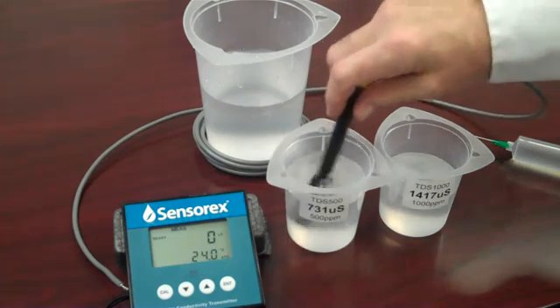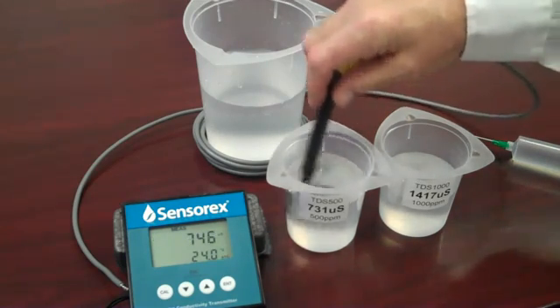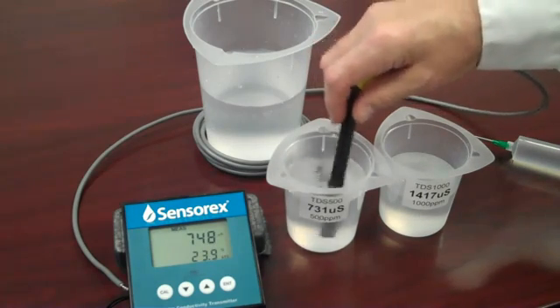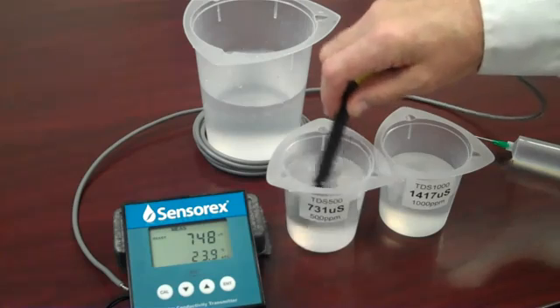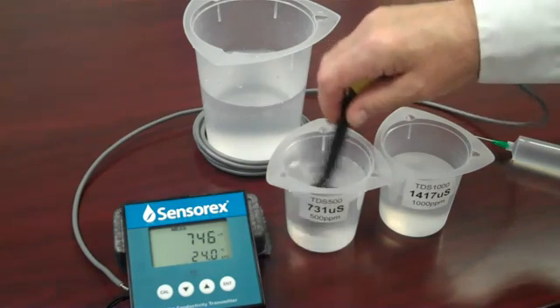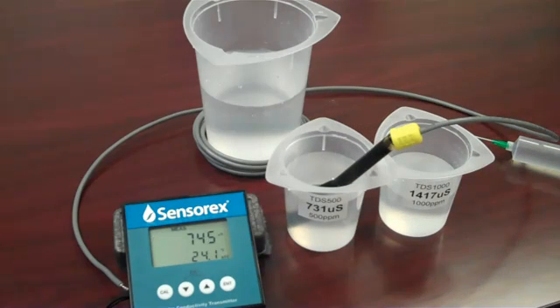Today I'll be using a solution of 731 microsiemens. This is a mixed salt solution and it has 500 parts per million total dissolved solids. I'm swirling the sensor around in the beaker to remove entrained air bubbles and ensure a proper and stable reading. We have to wait a minute or two for the reading to stabilize.